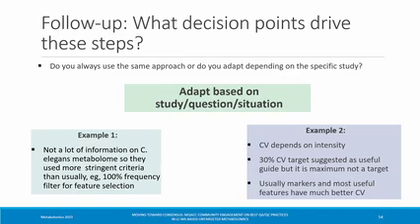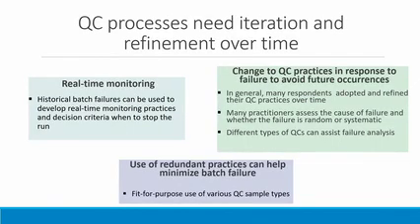And in general, again, this was very study dependent. So for example, in a C. elegans study, because the metabolome was not very well known, they decided to use a more stringent frequency filter where the metabolite had to be present in all biological samples, so 100% frequency filter. In another example, they explained that they target 30% CV filtering, but in general, their good quality features should have much better CVs than this. So this 30% is not really a target, but kind of the maximum that can be allowed.